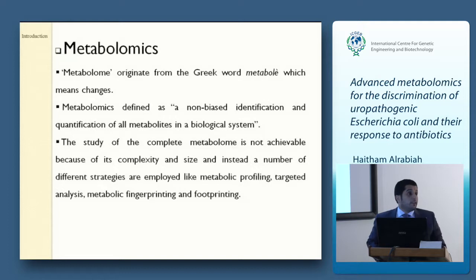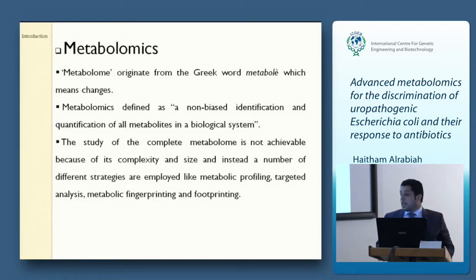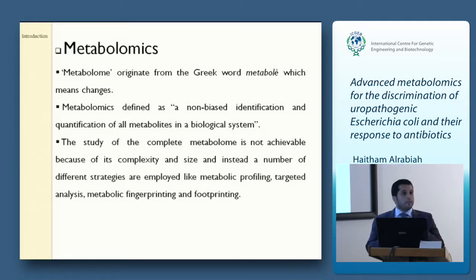It's defined as a non-biased, comprehensive identification and quantification of the entire metabolome under a given set of conditions, with a high selectivity and sensitivity in analytical techniques. Unfortunately, there is no one particular technique or combination of techniques that can detect or determine all metabolites in a mammalian, plant, or microbial metabolome.